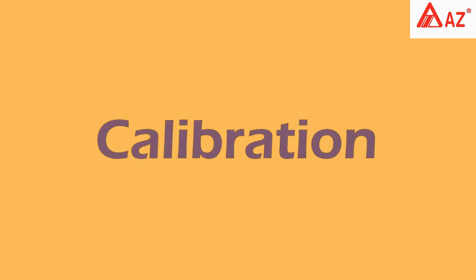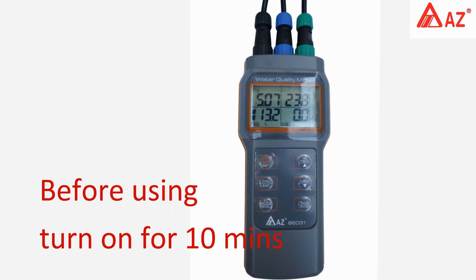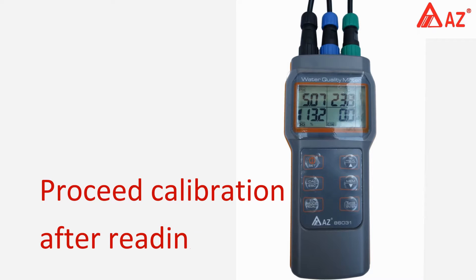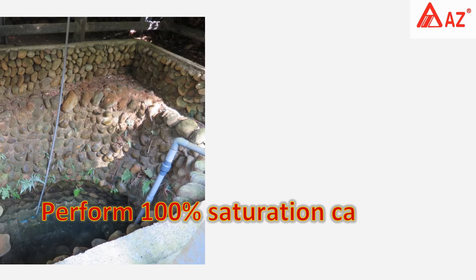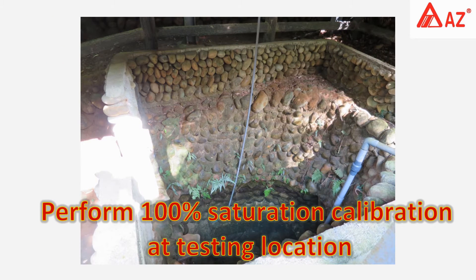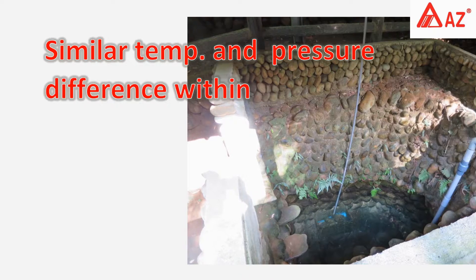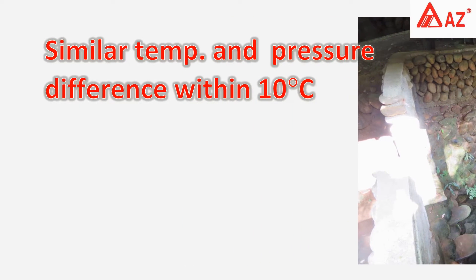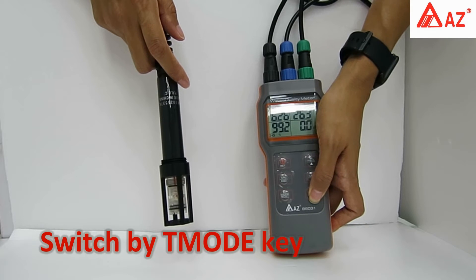Calibration for dissolved oxygen: before using, turn on the meter for 10 minutes, then proceed with calibration after the reading is stabilized. Before each operation, perform a 100% saturation calibration at the testing location, or in a similar temperature and pressure environment. Temperature difference should be within 10 degrees Celsius.